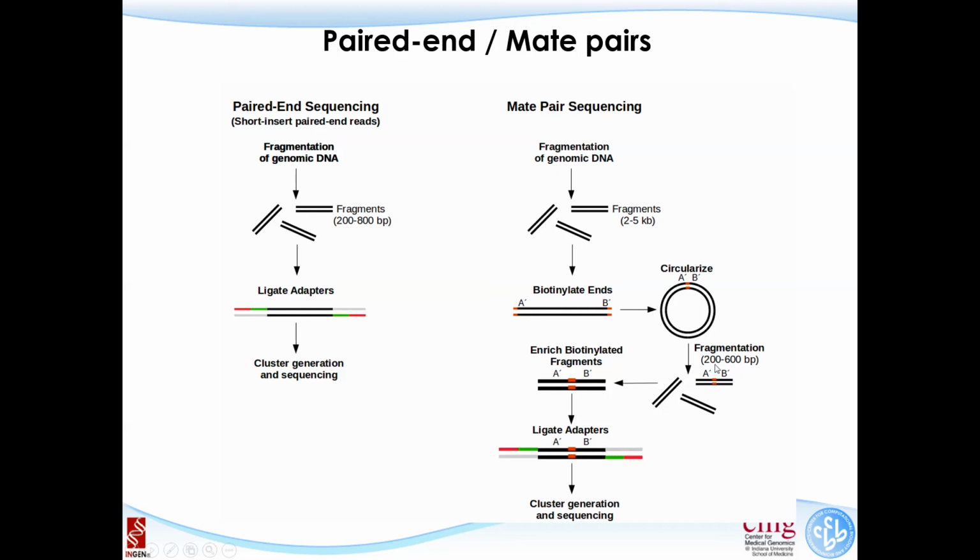The middle part gets thrown away, because there's no biotin. What you keep is a molecule carrying a part of one end and a part of the other end, put head to head or tail to tail, depending on how you look at it. Now we have a much shorter fragment.